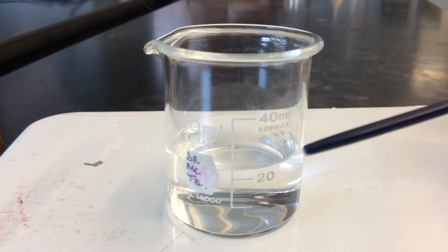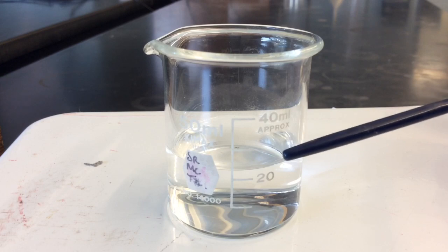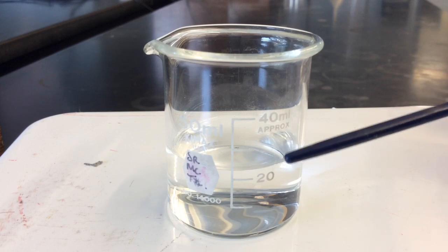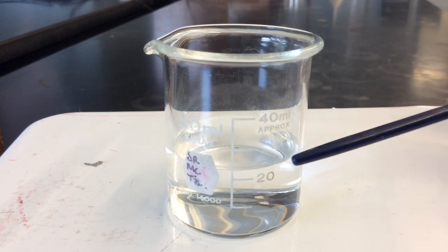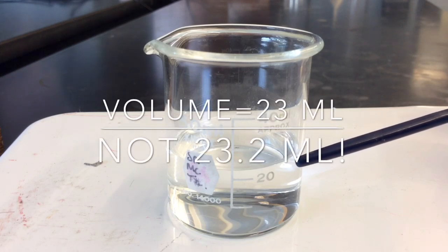There is clearly more than 20 milliliters of liquid in this beaker, and there is less than 30 milliliters. But in between these two graduation marks, the exact volume is uncertain. Since we can't differentiate between 22, 23, or 24 milliliters of liquid with the beaker, it does not make sense to read the volume even more precisely. For example, it would be incorrect to record the volume as 23.2 milliliters.